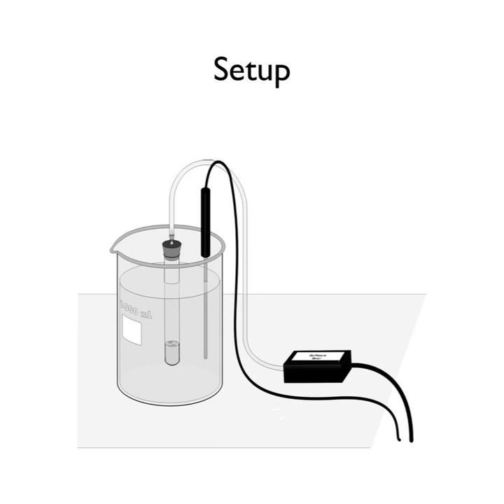Data will be gathered for about 3 minutes. If necessary, I recommend we do this, gently hold the test tube so that it stays completely immersed in the water bath. When the data collection is complete, carefully remove the stopper from the test tube to relieve the pressure. Dispose of the contents as directed by your instructor.